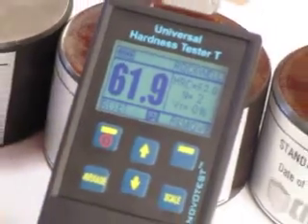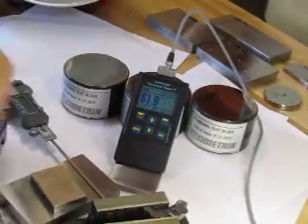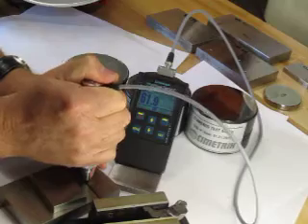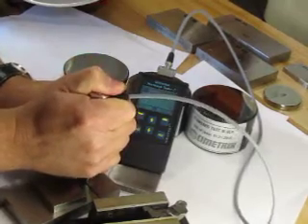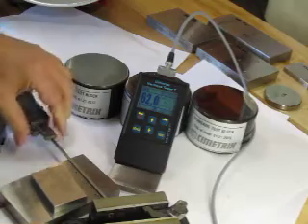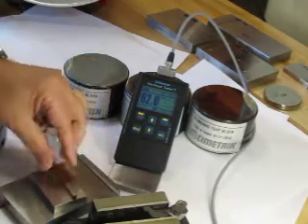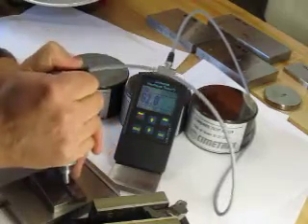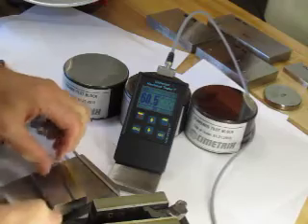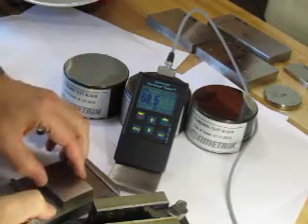With this device we can also do very thin parts — checking hardness where it would not be practical for a rebound-type tester. I place the device on the thin part, push down, and get a hardness value. Even on a relatively small part, I come over on the part and get a result.